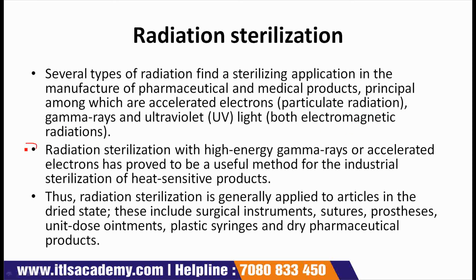Next point is, radiation sterilization with high energy gamma rays or accelerated electrons has proved to be a useful method for the industrial sterilization of heat sensitive products.